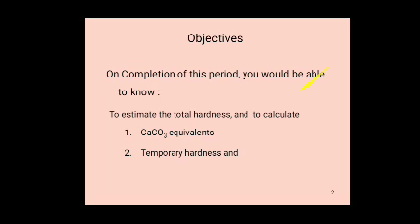CaCO3 equivalents, temporary hardness, permanent hardness calculated by using CaCO3 equivalent weight. Hardness of water calculated by using degree of hardness.